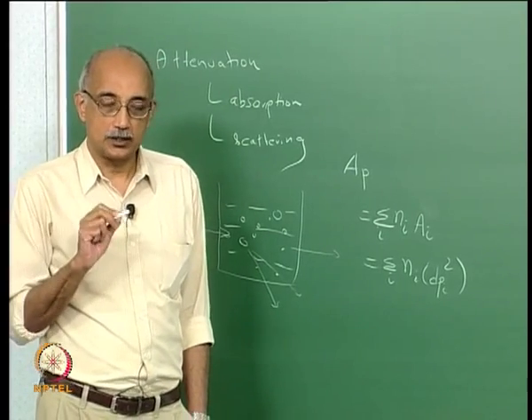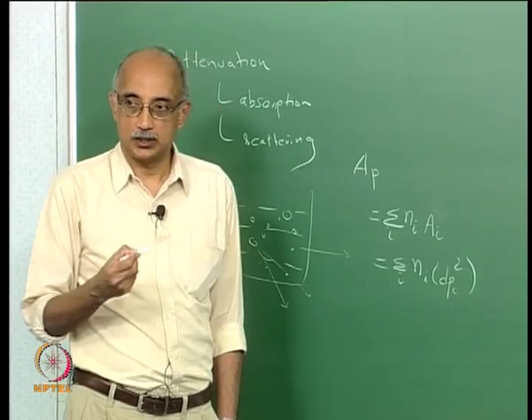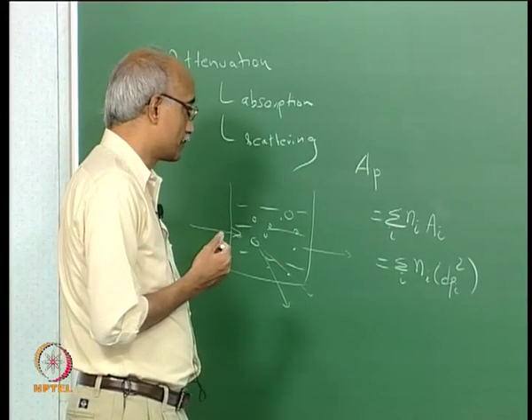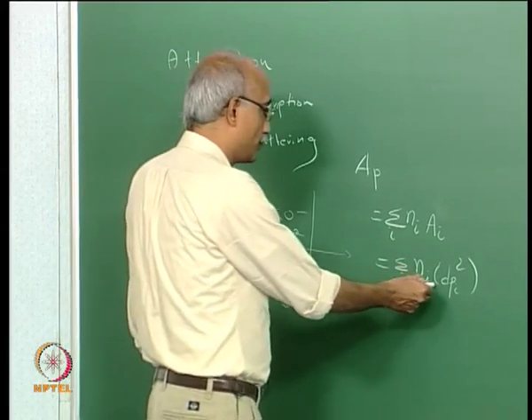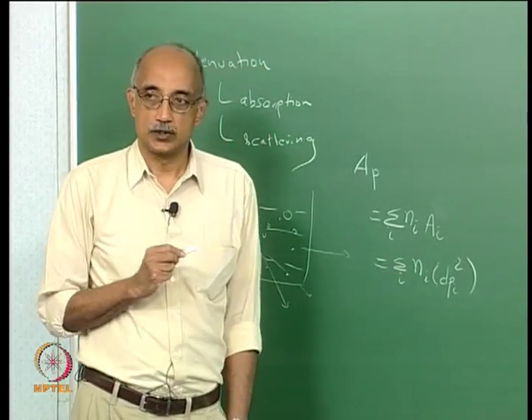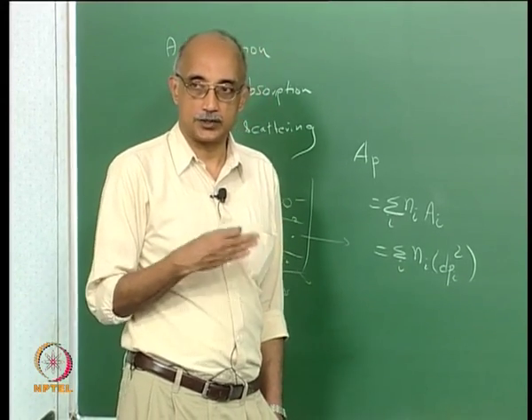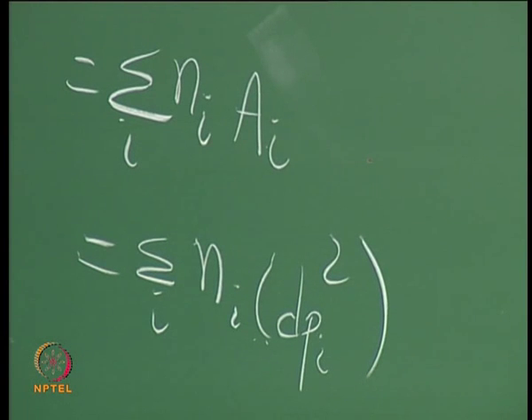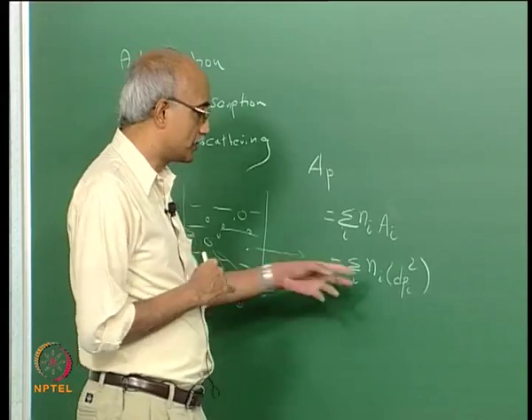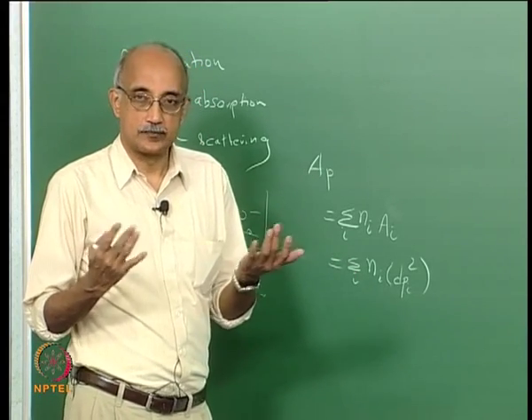The scattered light intensity is a measure of turbidity in the suspension, and the scattered light is proportional to the total scattering cross section of particles in suspension, which is related to the parameter summation over i of N_i d_pi squared. So, from this, how do you extract, let us say, a mean size?